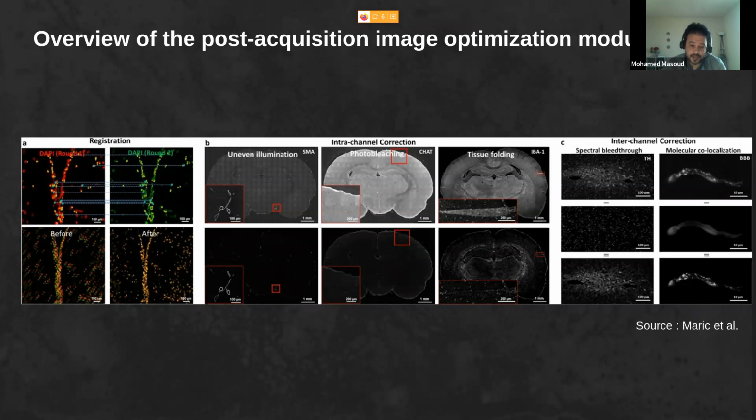These noises and distortions need some pre-processing at this stage. They mainly used a technique called alternating sequential filters, and it gives much better results, as shown at the bottom.